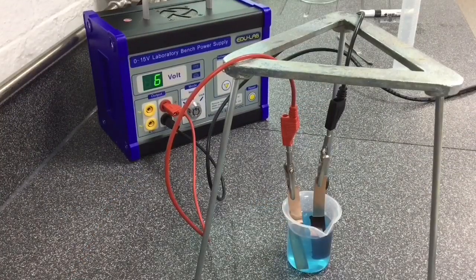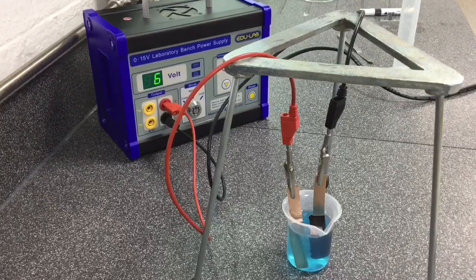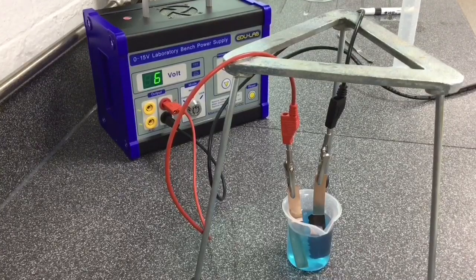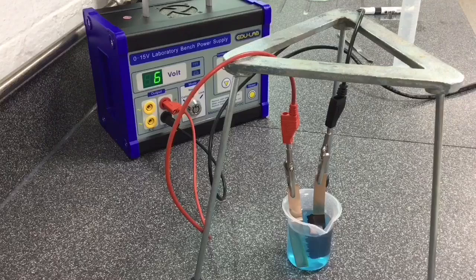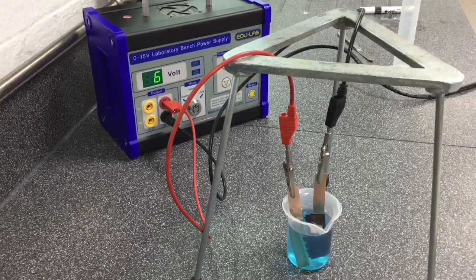When the electrodes are placed into the copper sulfate solution you can see the electrolysis process begin. This is evident when you look at the cathode which is represented by the black wire. Here you can see the build-up of copper.